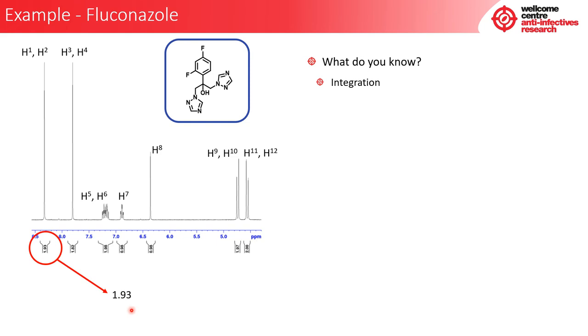What are the next things that we want to be able to understand? Well, we now want to be able to understand the regions in the spectra. And what I mean by regions is, where do things fall in relation to functionality? We know from previous talks that aliphatic regions are about 0 to 3 ppm. Aromatics, for instance, are about 6 to 9 ppm. And what is our spectra telling us? Our spectra, first of all, is telling us that we have a large set of aromatic peaks, 8 of them in total. And we have something that is falling either as an aliphatic or something that is potentially heteroatoms, for instance.